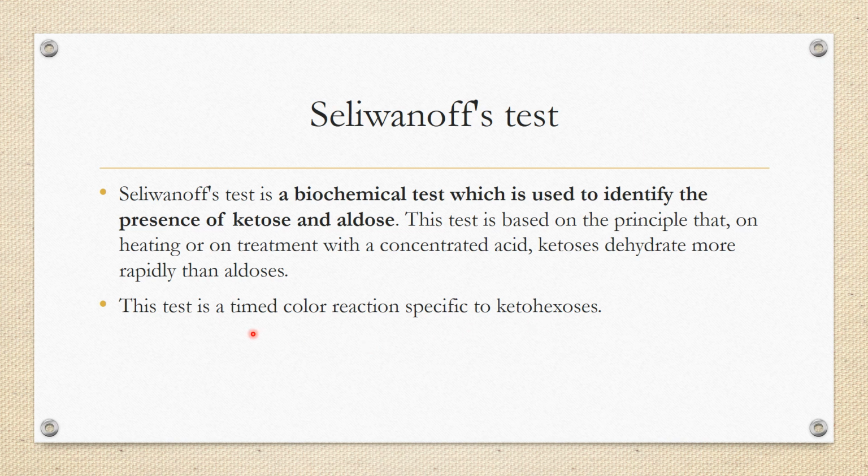What is the meaning of timed color? That means at a short time, like 1 minute or 30 seconds, not more.